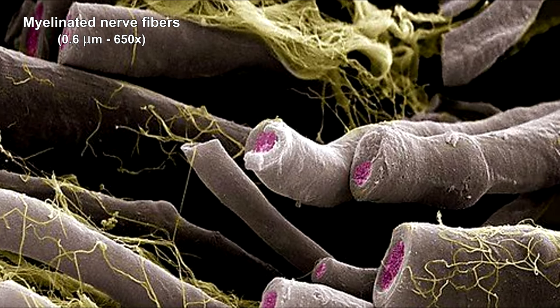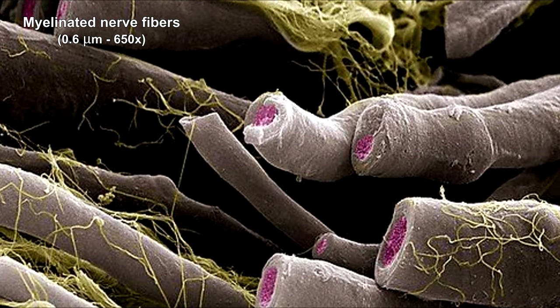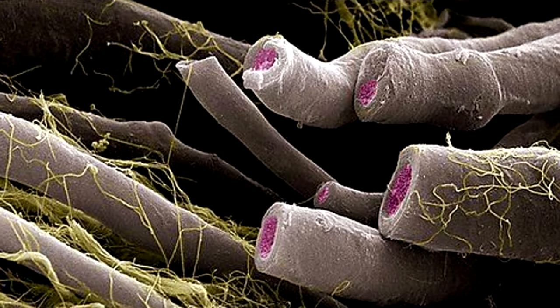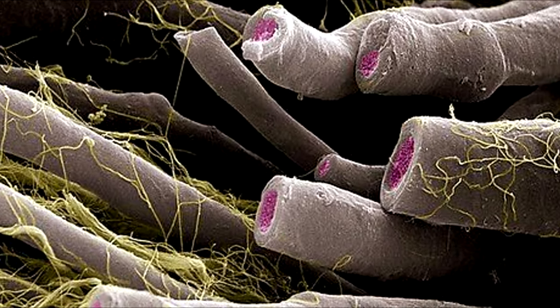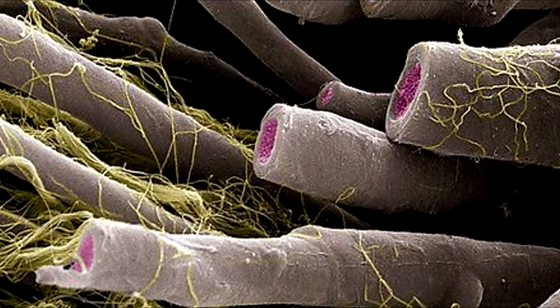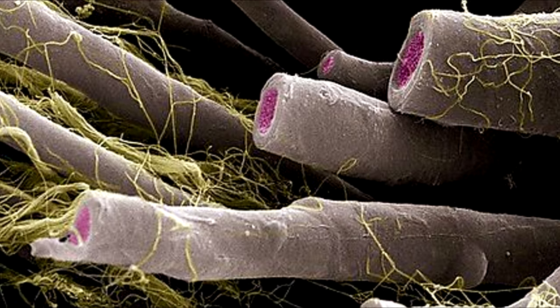A nerve fiber is a thread-like extension to a nerve cell. Here's a colored scanning electron micrograph of myelinated nerve fibers. The myelin sheath is gray, the nerve inside is pink, and the connective tissue is yellow.